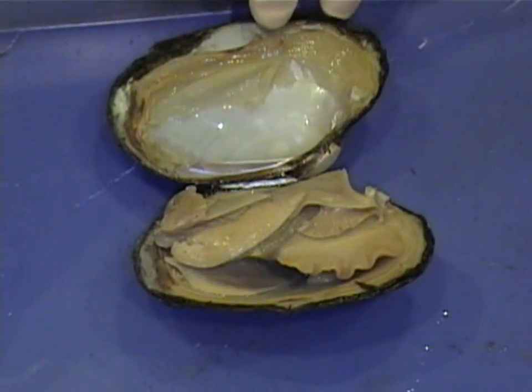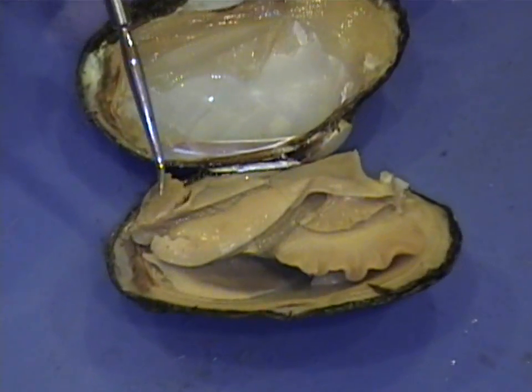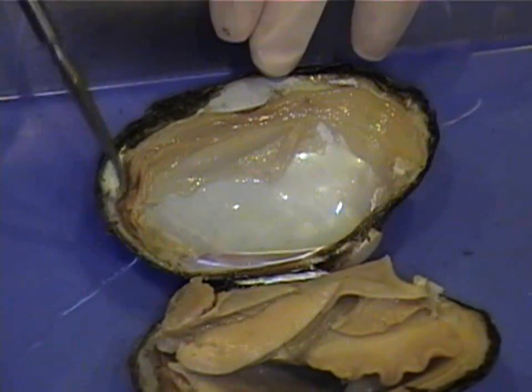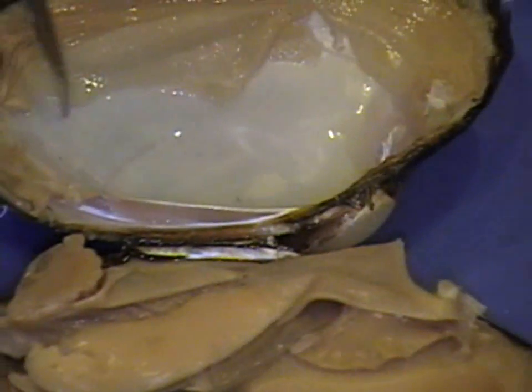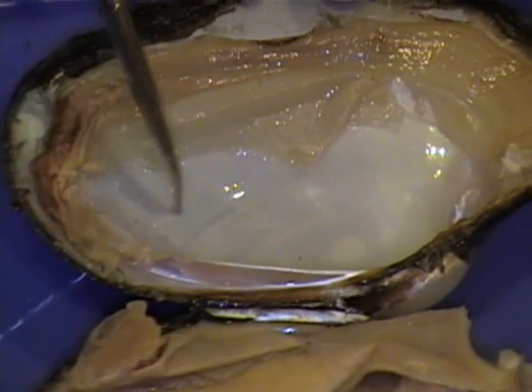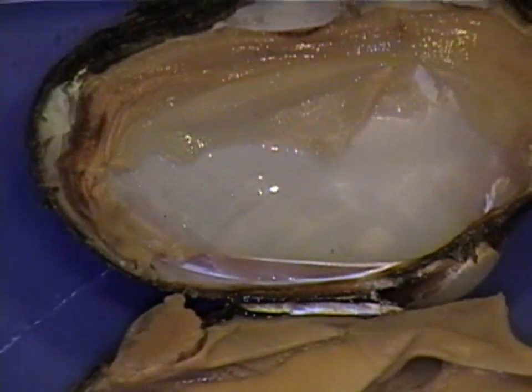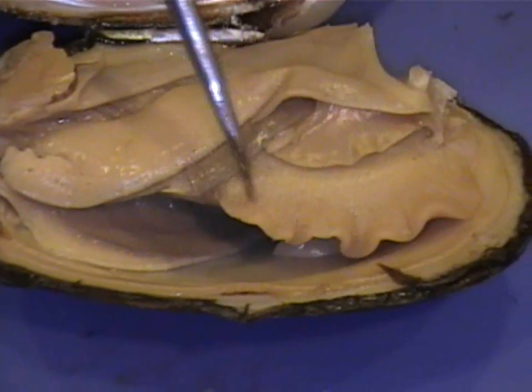We're now going to take a look at the inside of the bivalve. After scraping away the adductor muscle, we're going to take a look at the inside of the shell. Right here you see part of the mantle. Here are the adductor scars. And then we see the inside of the pearly nacre of the shell. Right over here we see the foot. It's greatly reduced in preserved specimens.